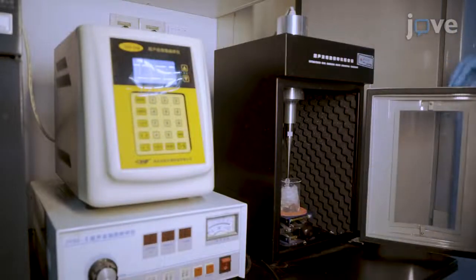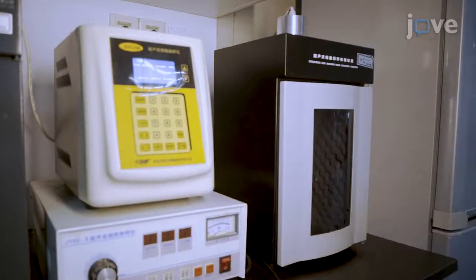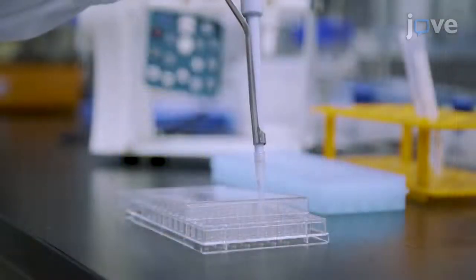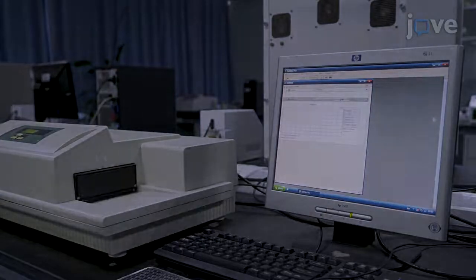To perform the immunoprecipitation, lyse cells in buffer A1 via sonication and freeze thaw. Measure protein concentrations and normalize the protein amounts among the different IP samples.